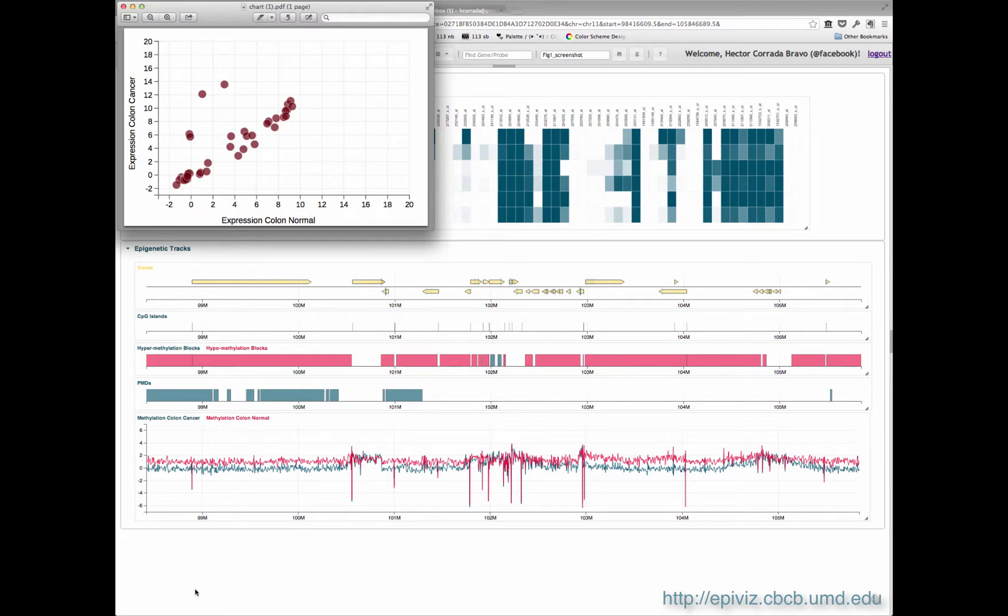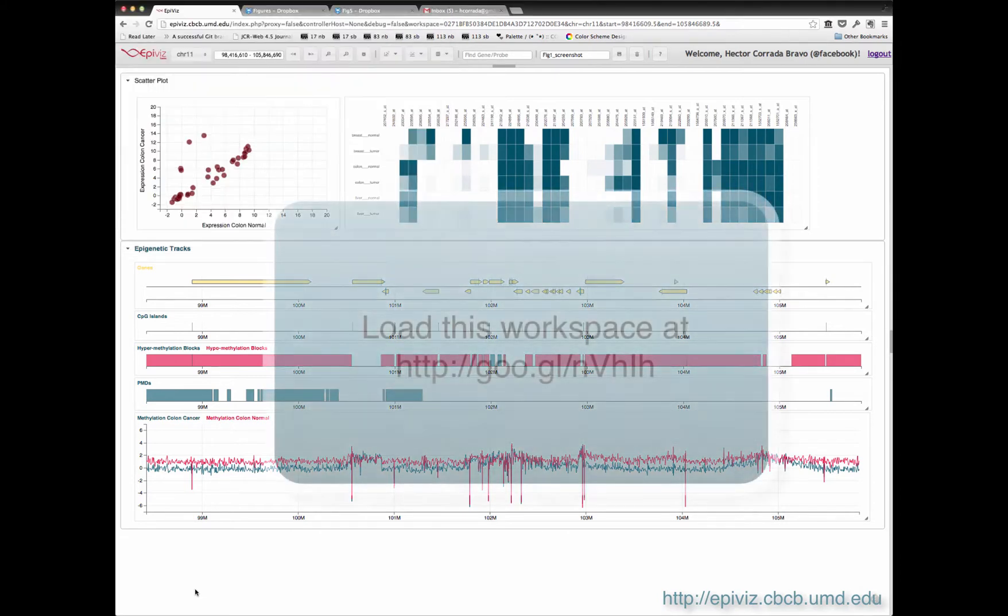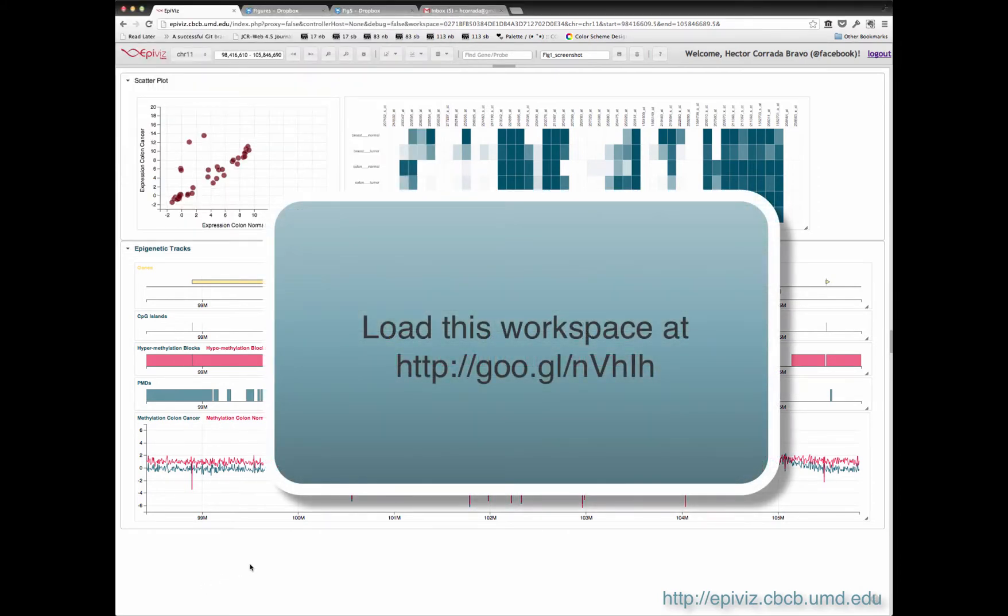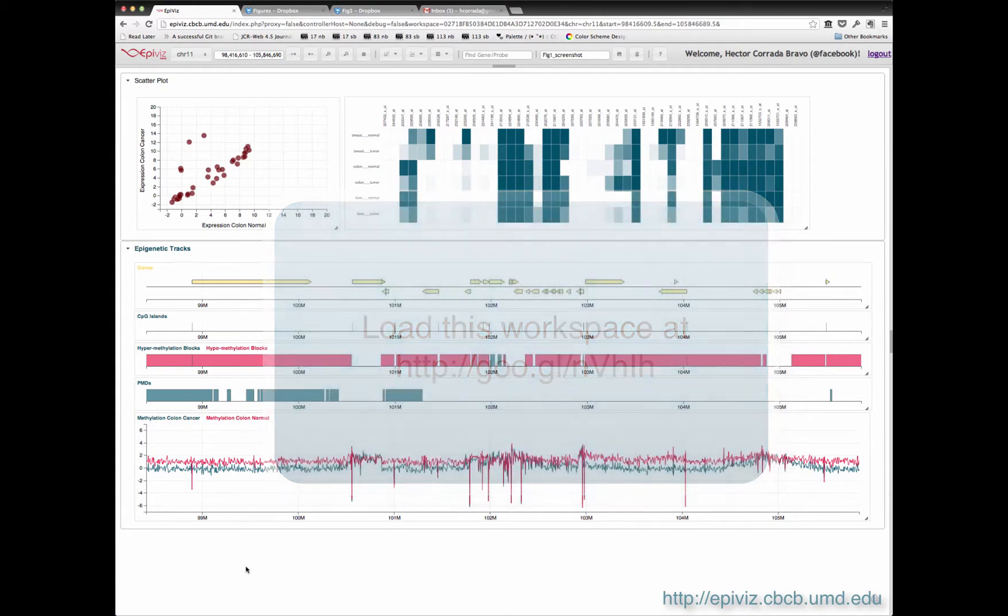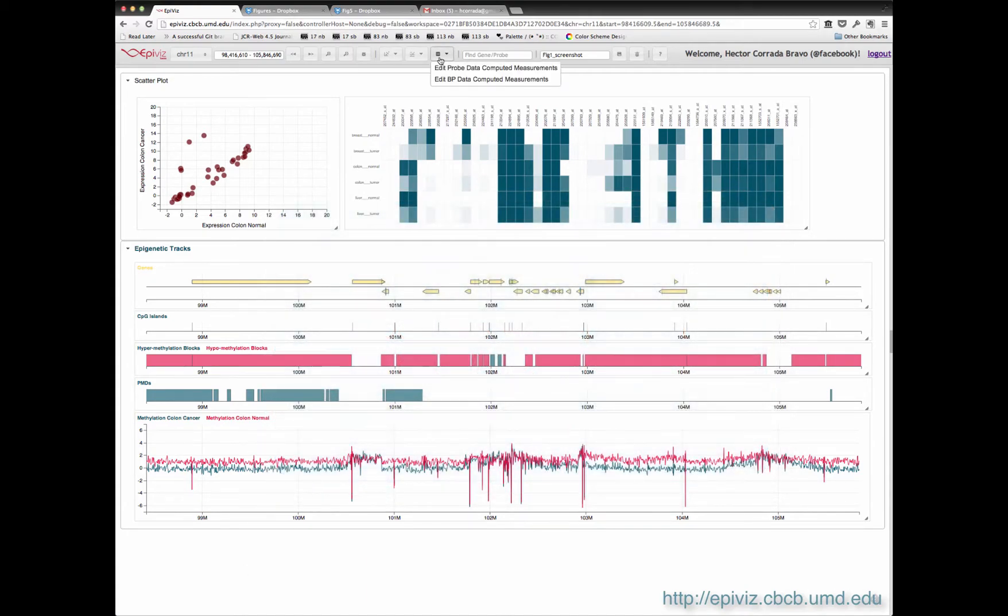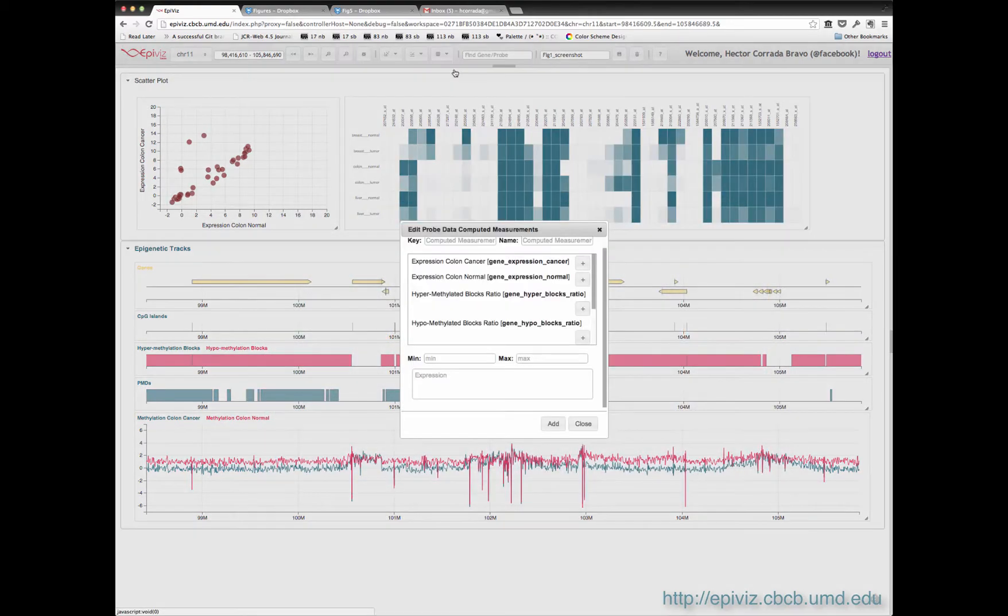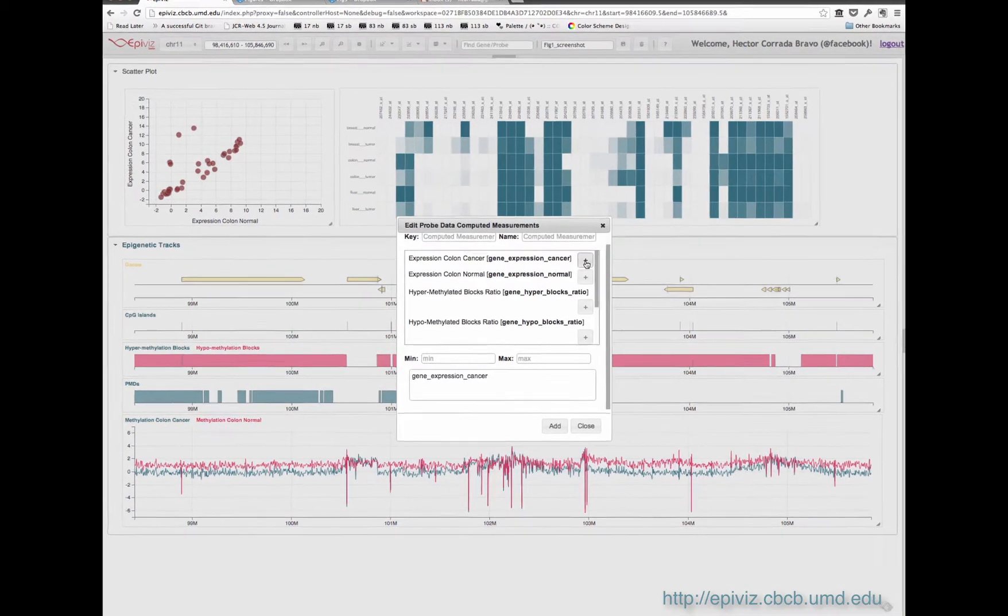However, we want to make reproducible dissemination of results easy, so users can save and share workspaces with collaborators, or even link to them in publications. We distinguish data from visualization.